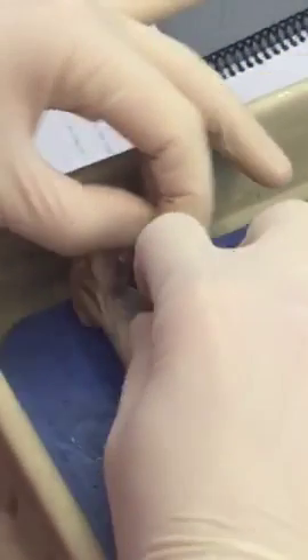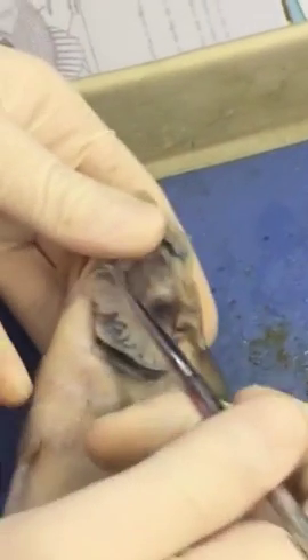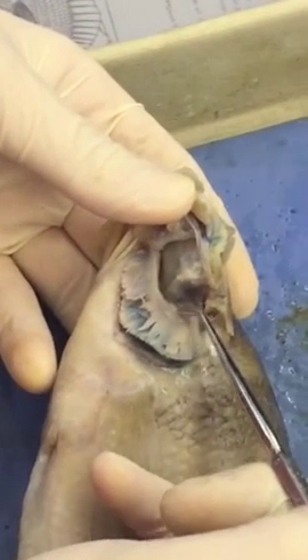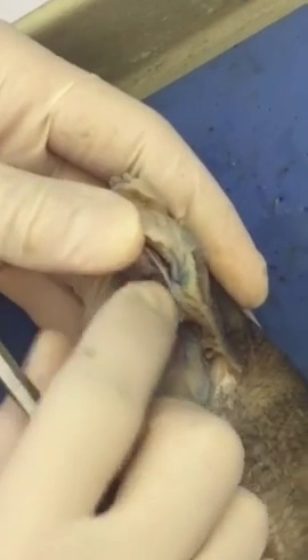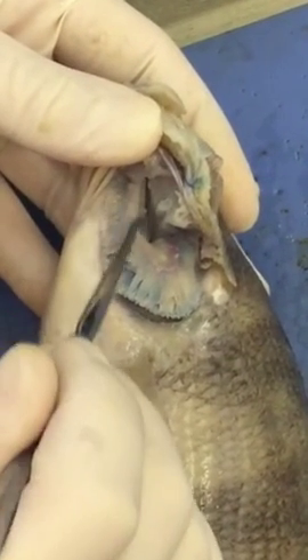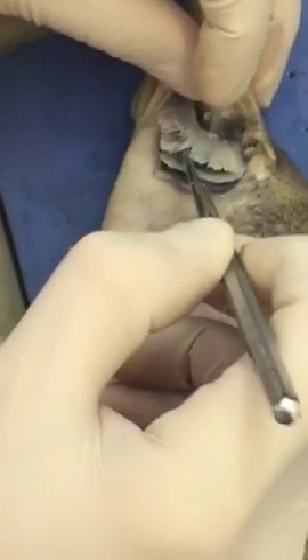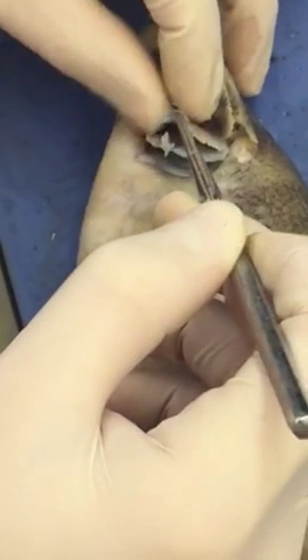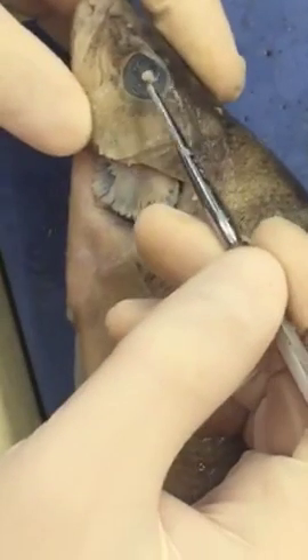You can see the gill arches right here. If you actually feel them, they're not sharp — they feel almost like very thick sandpaper. Those are the gill rakers, and they're actually used for filtering out food. You can see there are several of them: one, two, three, and four. The video told you there were four, and the same thing on the other side.